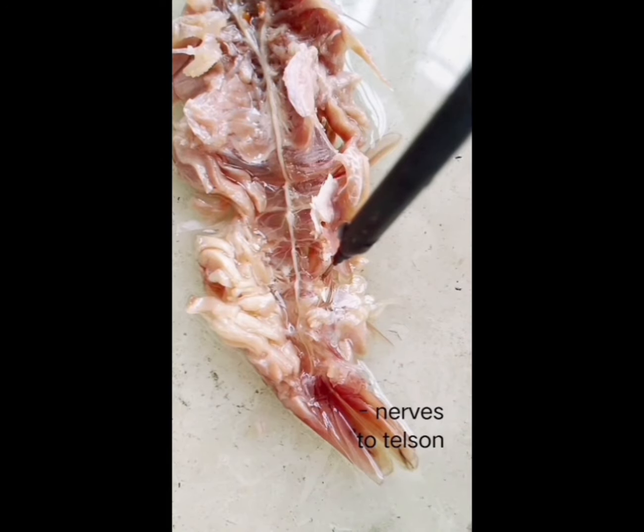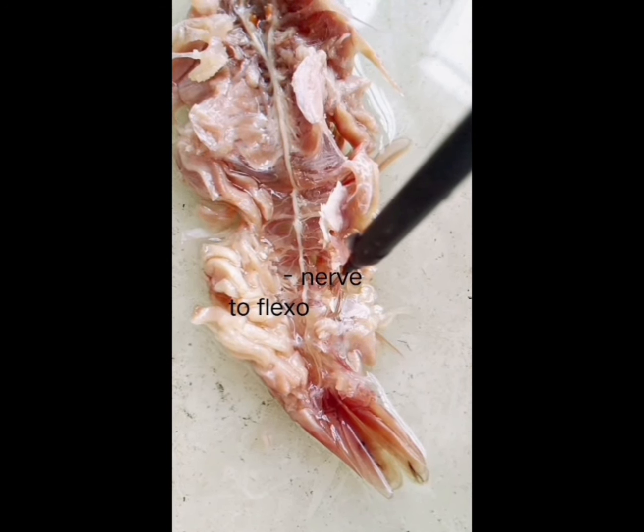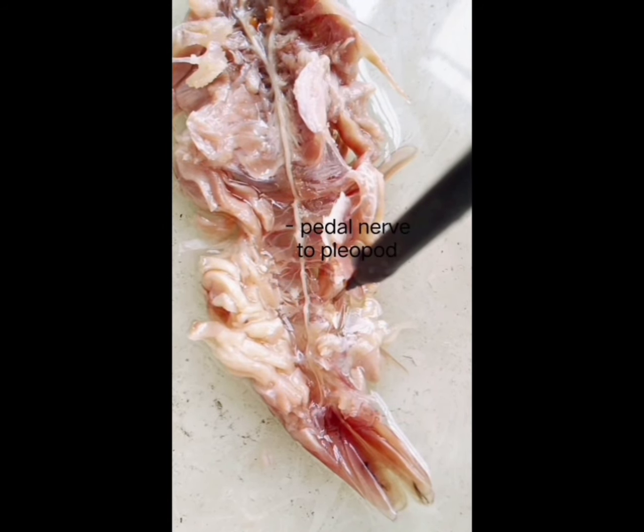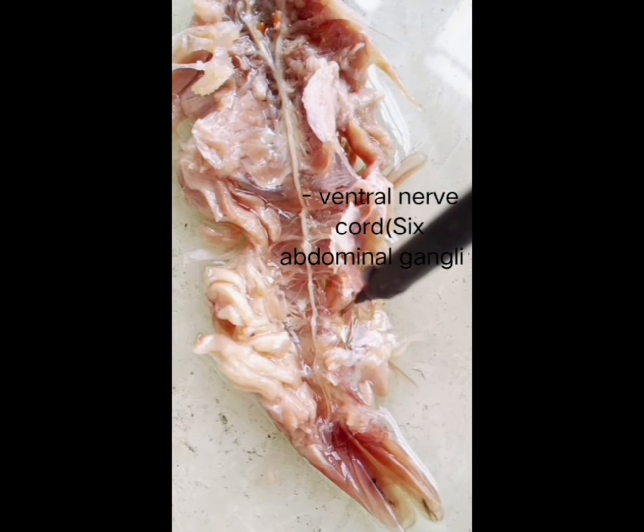Now the dissection is complete. We can identify the nerves to the telson, nerves to the uropod, nerves to the flexor muscle, nerves to the extensor muscle, pedal nerves to the pleopods, the ventral nerve cord, and the ventral thoracic ganglionic mass.